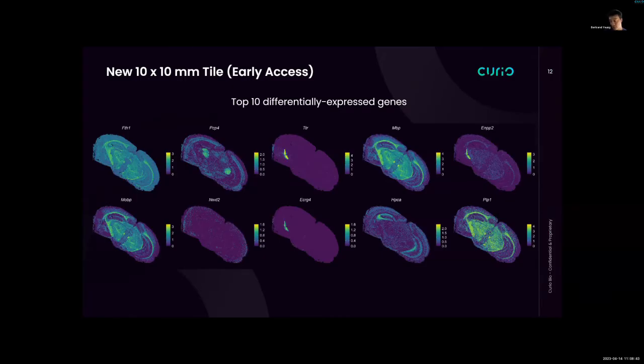One thing I'll mention, at least for the data set from Joe Ecker's lab, they didn't need to adjust the protocol at all. It just happened to work right out of the box. We had been anticipating that we would need to adjust it because of the cell wall, trying to digest it completely and get it to solution, but apparently that wasn't the case, at least for this sample type. But I know there are other groups within the plant cell atlas that are looking at the protocol, seeing if any adjustments need to be made for the enzyme composition.